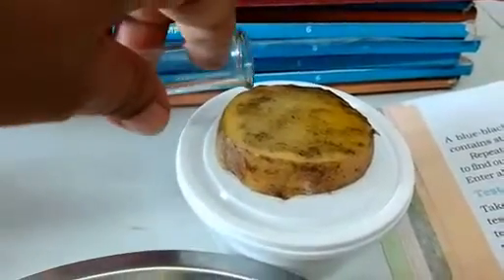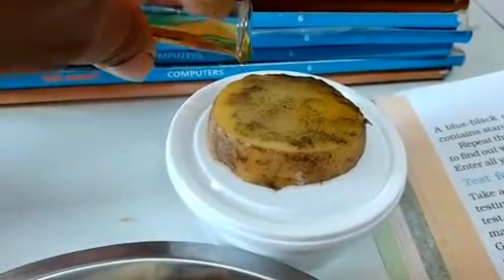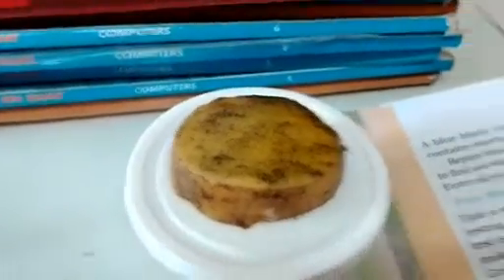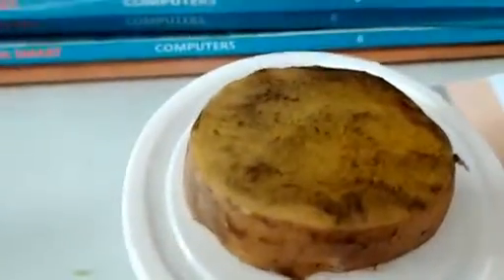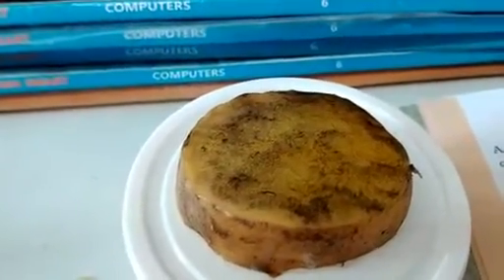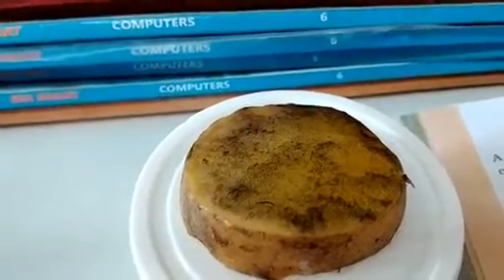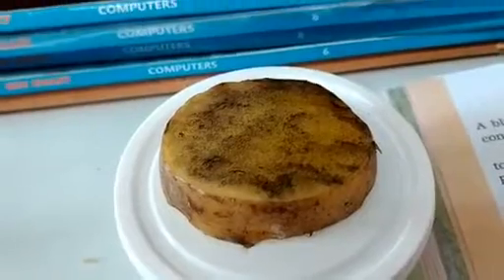Because I have diluted it, you cannot see a dark patch, but at least you can see brownish patches, blue black patches on the potato slice. This shows that it contains starch. So this is our starch test.